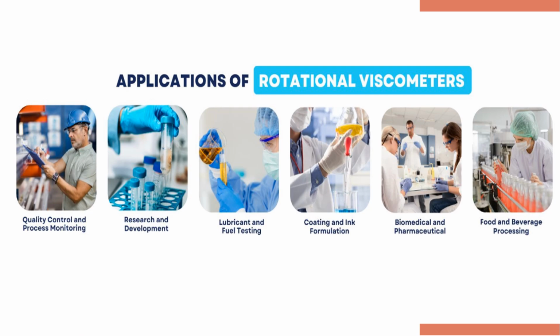Now we will see the applications of rotational viscometers. As I discussed before, there are many applications of rotational viscometers. The first one is quality control and process monitoring. That is, as I said, viscosity testing is one of the important methods which is used for checking the quality of products. Next is research and development. In research and development also viscosity testing is used to check the final quality of the product. Next is lubricant and fuel testing, and the next application is coating and ink formulation. And in biomedical and pharmaceutical industries also rotational viscometers are used. And the last is food and beverage processing industries.